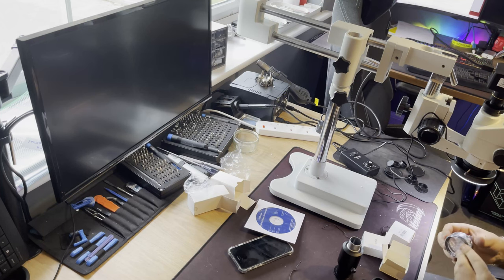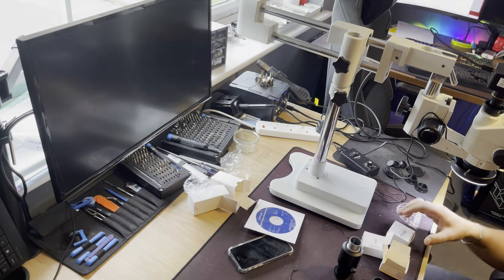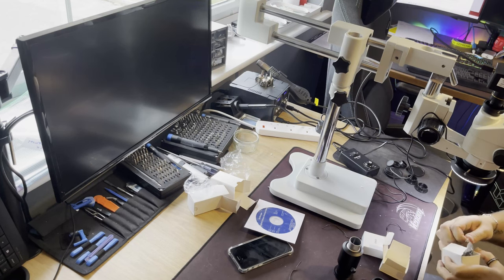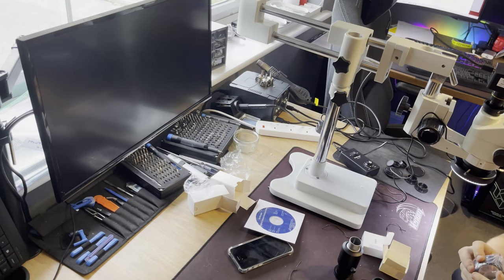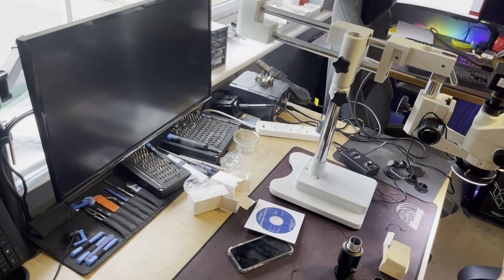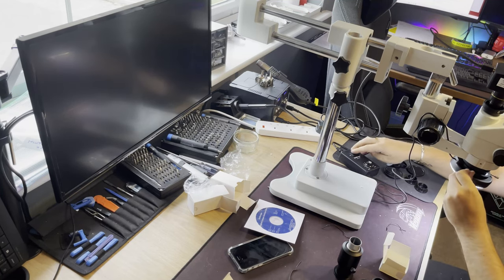So this is the 0.7 lens, which I'm not sure where it goes. I'm guessing underneath. And this is the 0.5 lens, the one that comes as standard with the microscope. And this is what? A 2x lens. So I know we're not gonna be using these two, we're gonna be using this one. So I'm guessing I'm gonna have to take these off. Let's turn it off.